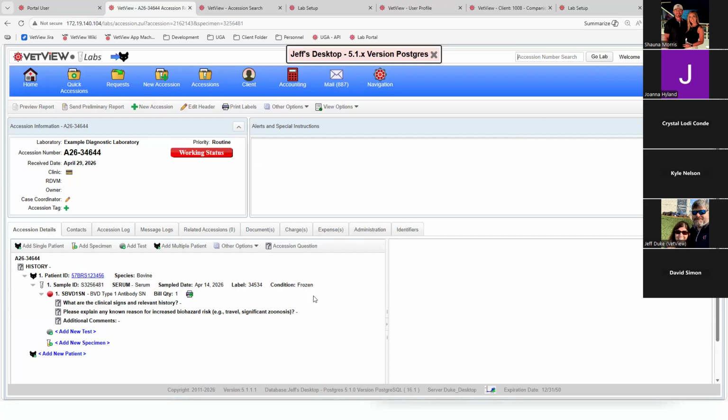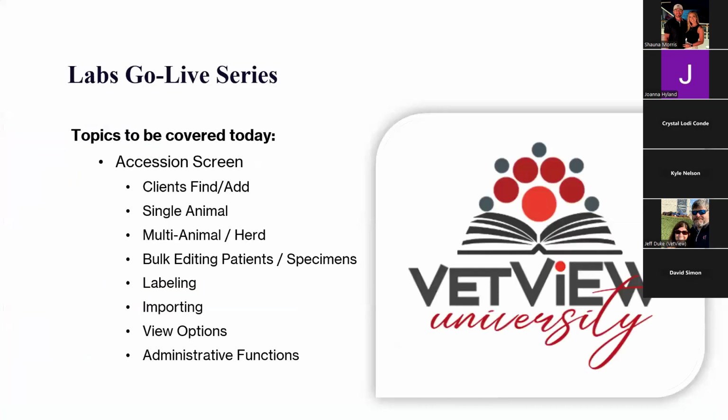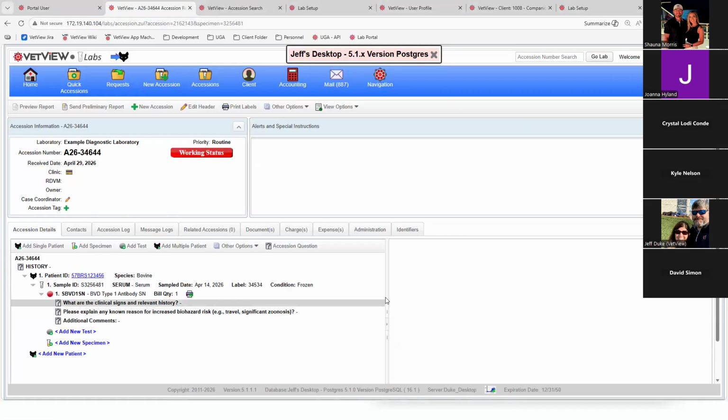All right. What else do I have on my list? Oh, administrative functions. And the last thing is administrative functions. What I mean by that is kind of going across the tabs up here.